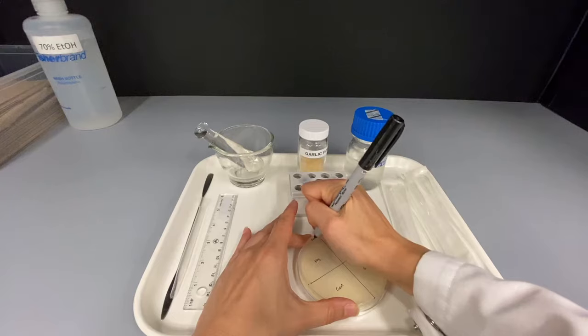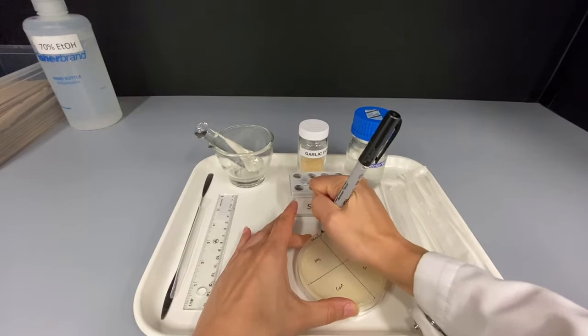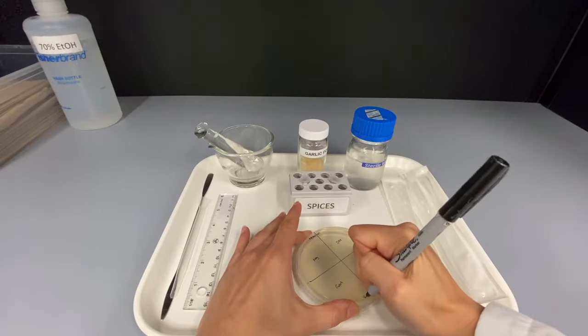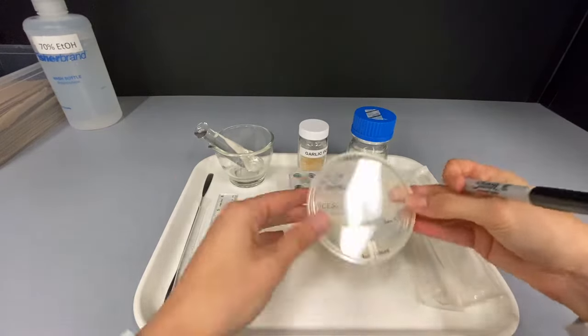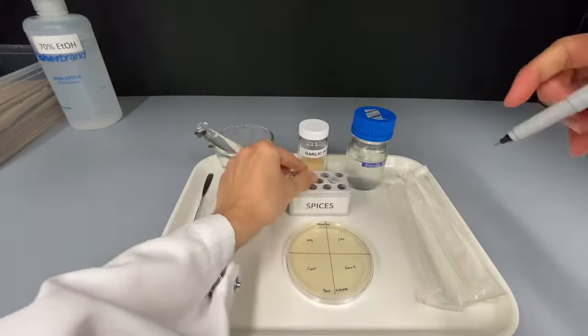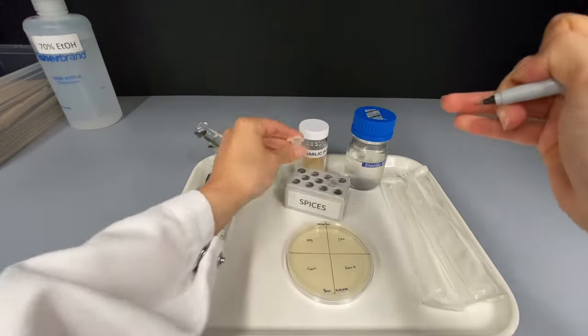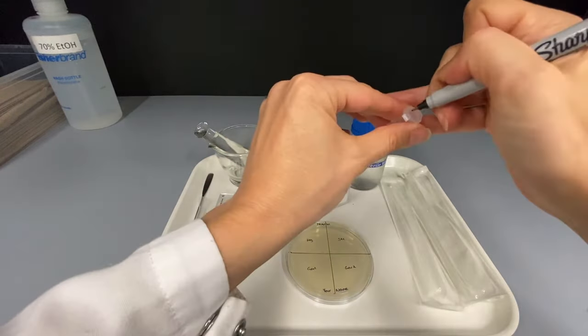You also need to write your practical number and your name on the underside of the plate. Keep these labels small and around the outer edge of the plate. Label the tubes GAR1 and GAR2.